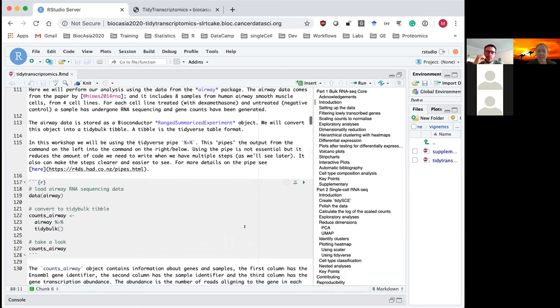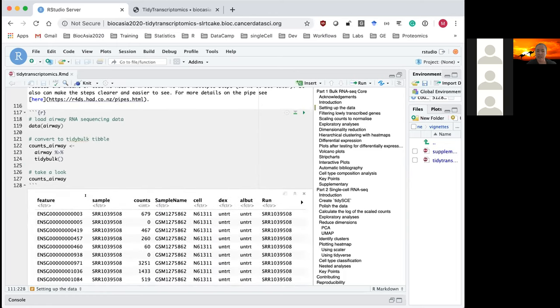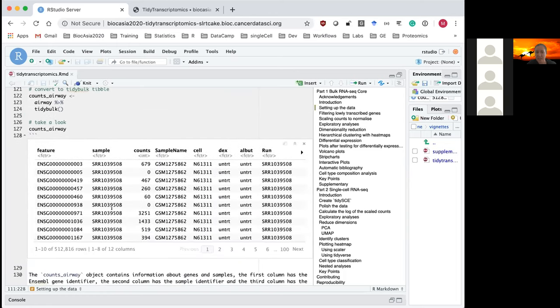The dataset I'm using for this bulk RNA-seq part is from the airway Bioconductor package. It has eight samples from four different cell lines — each cell line has a sample treated with dexamethasone and one untreated negative control. The first thing we do is convert our data into a tidybulk tibble — a tidyverse table format. It contains our genes, sample IDs, RNA sequencing counts, cell line information, and treatment status.